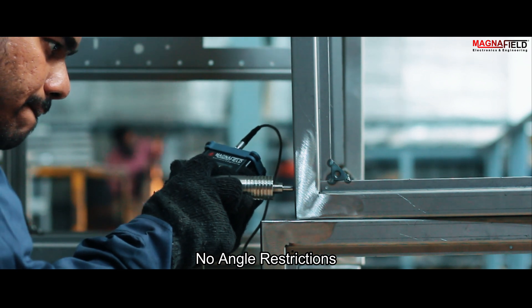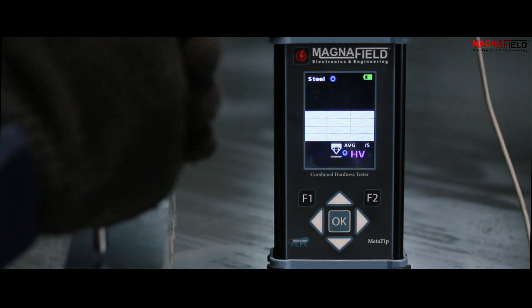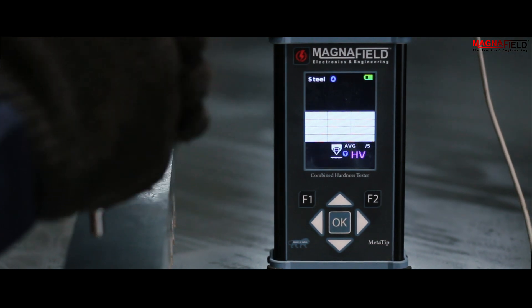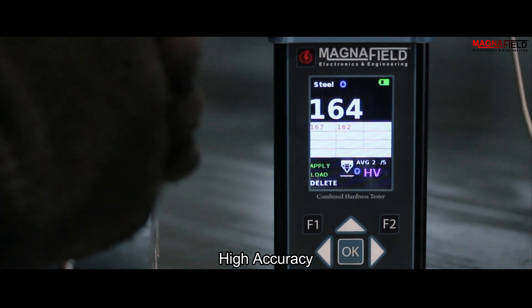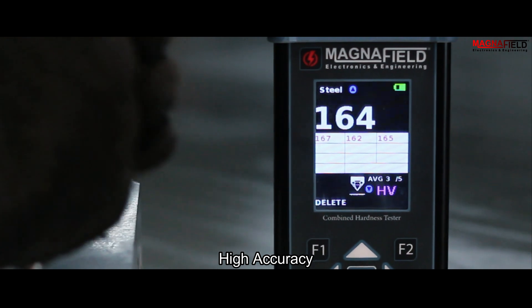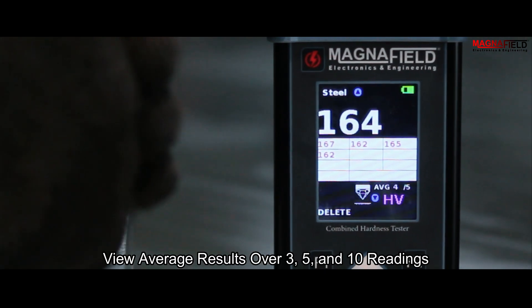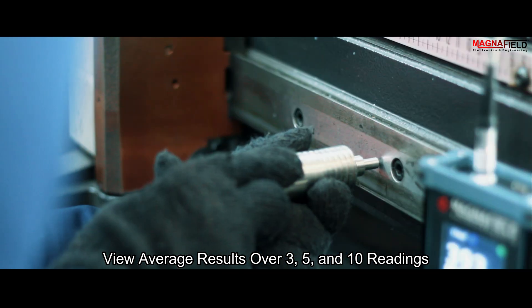Readings can be taken from any angle, even upside down. Our combined hardness tester excels in accuracy and efficiency, providing precise measurements swiftly. You can view average results over 3, 5, and 10 readings, or results can be obtained directly.